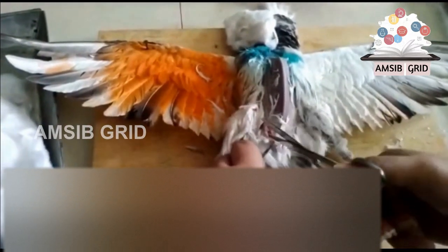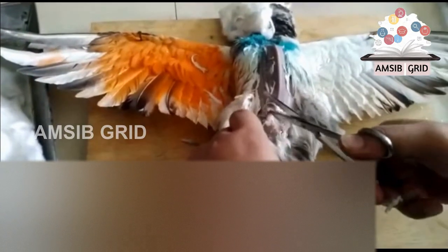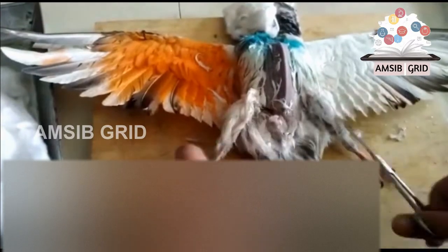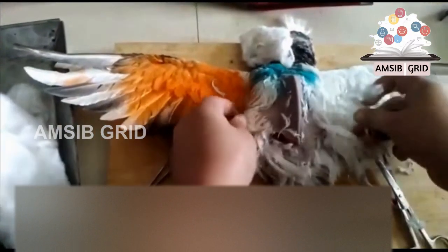Fourteen. With a pair of forceps, lift the skin at the opening just above the tail. Make a shallow cut through the lifted skin with your scissors. Fifteen. Insert the scissors into the opening and cut through the skin along a midventral line, from the cloacal opening to just under the head.